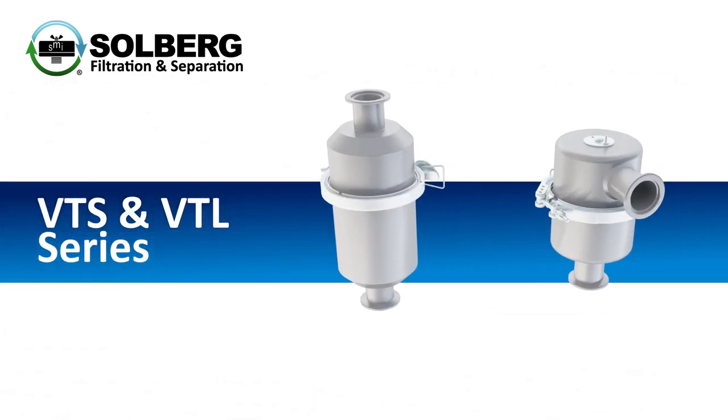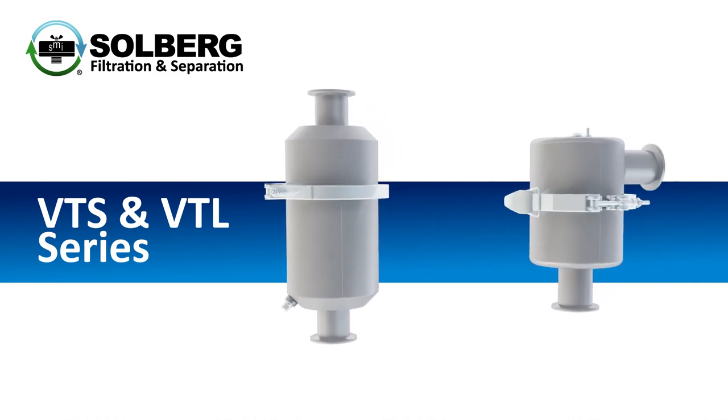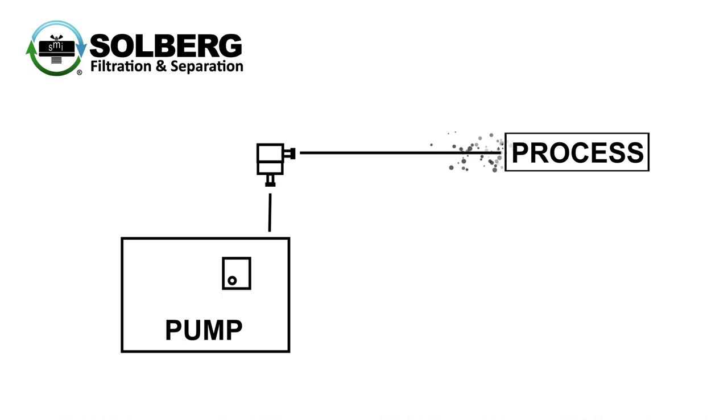Solberg's VTS and VTL product series offer versatile foreline traps that provide maximum protection for vacuum pumps and components. The traps are designed to capture oil, water, or chemical vapors either coming from the process or due to backstreaming.